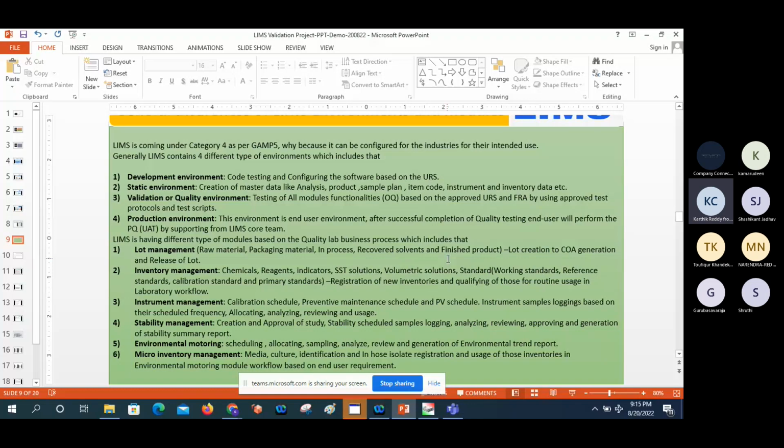Sterile injectable organizations like injectable sites and pharmaceutical organizations use this media, culture, and identification for most of the things. API industries also follow it, but it's limited. But this inventory management can be used for the majority of things with sterile tests, like in formulation organizations.